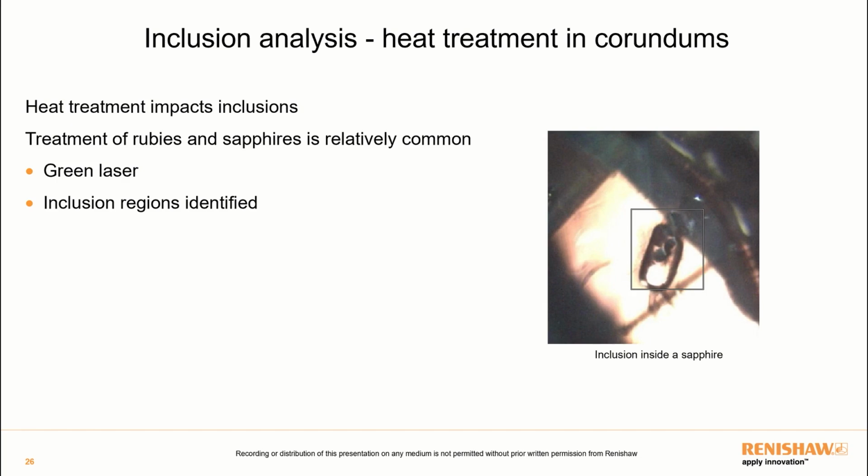The collection technique is called StreamHR. That is an imaging technique that is optimized for the spatial resolution. And because a 3D image is made by stacking several 2D high-resolution images, the resulting dataset is composed of a massive number of spectra. In this case, we collected 2.9 million spectra.